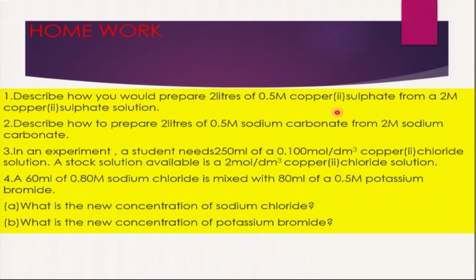Make sure you are very accurate, because when you are measuring these solutions, accuracy is a must. Therefore, the solution that you have prepared will contain 0.5 molar copper 2 sulfate. That is what you are supposed to do, even with other questions.